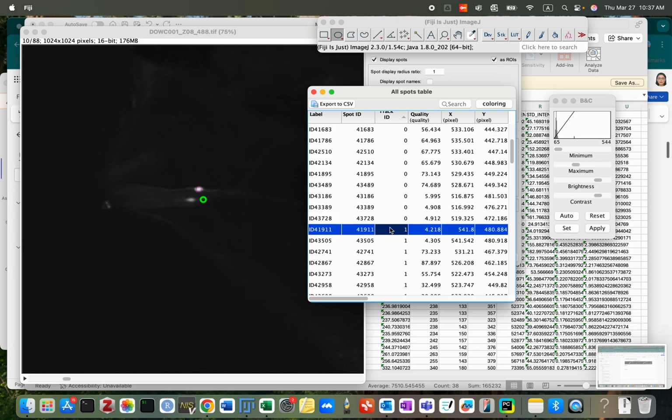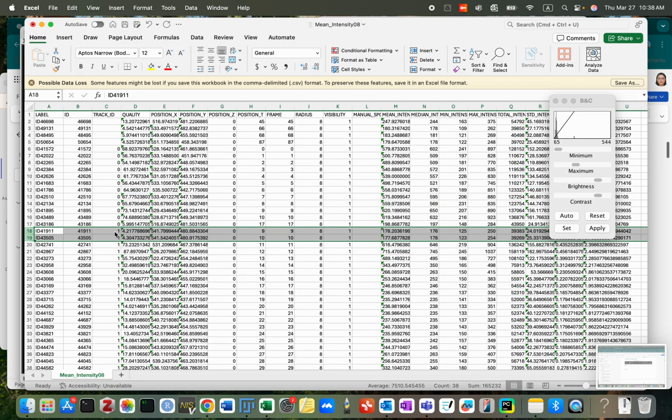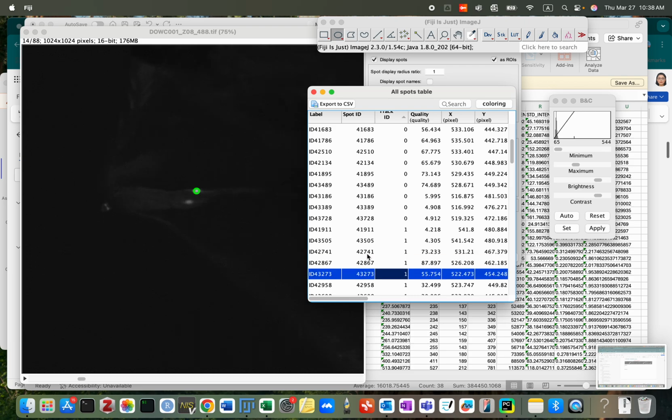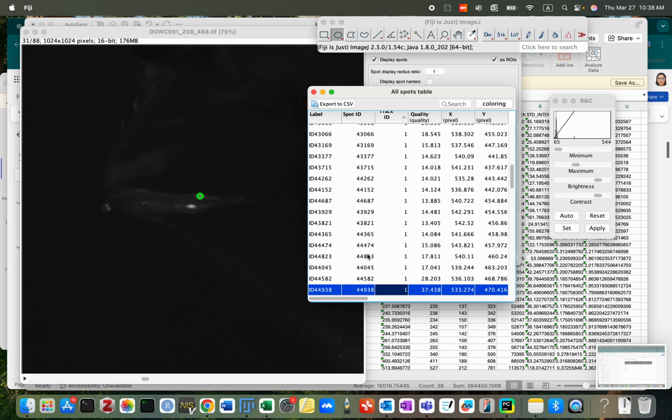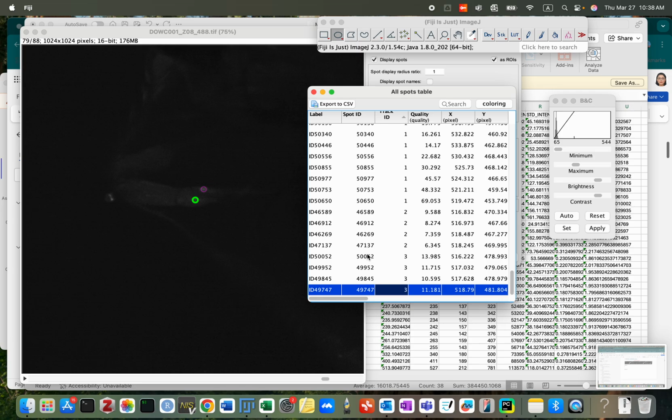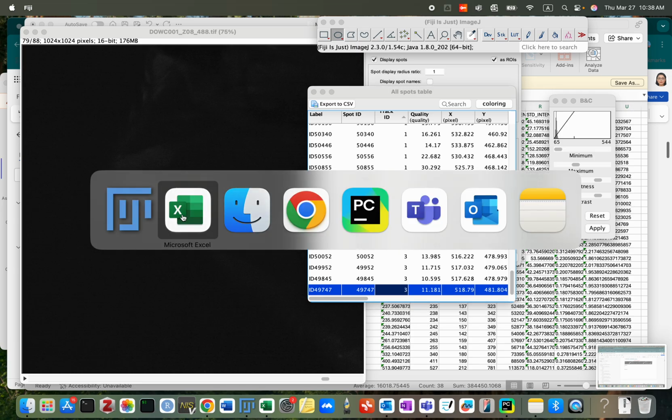And then checking ID number 1. This is wrong. 2 of them are wrong. Delete these 2. From 42, 7, 41. 42, 7, 41. That's neuron 0. Correct again. Okay, good. So all checking ID number 1, that's correct. Then number 2 is wrong. Number 3 is wrong. 2 and 3 we need to delete.